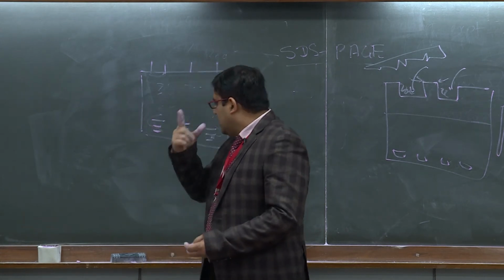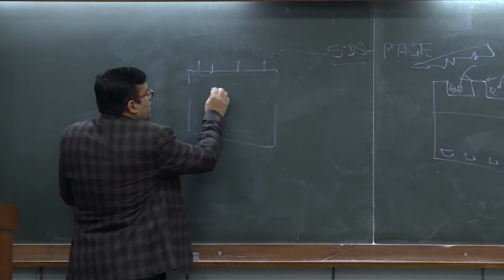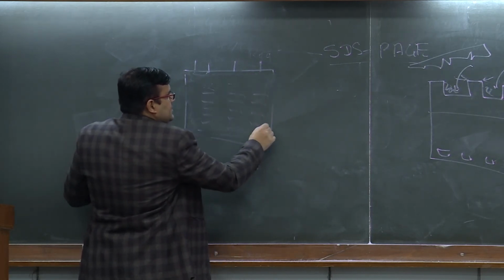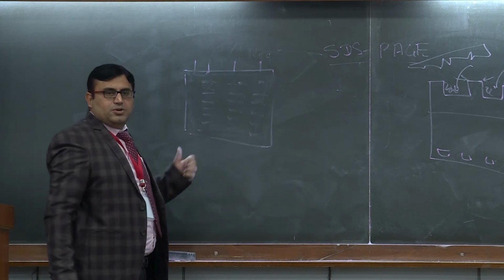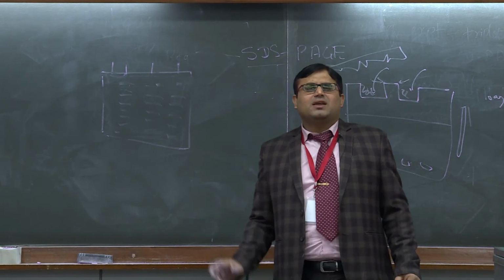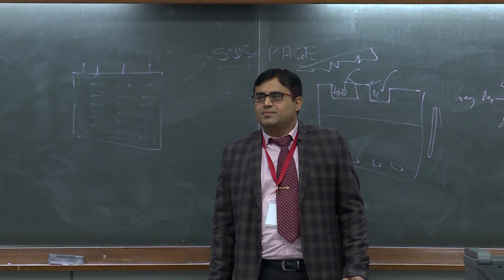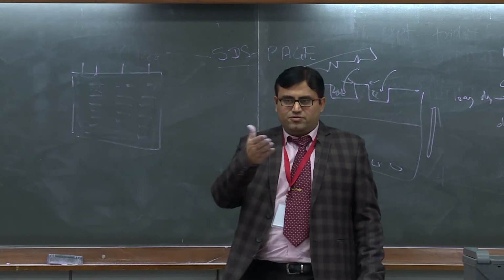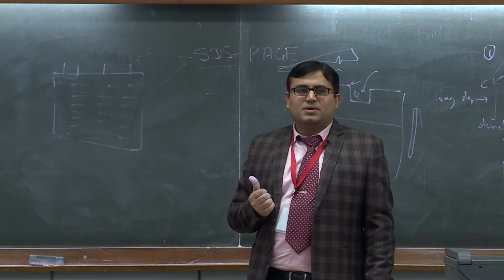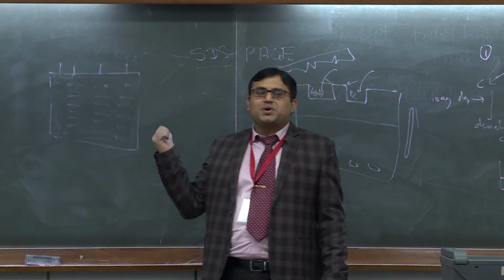So many times, one last situation I'll give, because this happens commonly. Now you'll get protein like this. This happens commonly with all. Now you have to tell me what is the problem. Very light faint band, protein is there but it's very faint, light. If any one of you have done SDS Page, maybe you have encountered such a problem. Limited quantity of protein? That may be one of the reasons, but that is not the reason in this case.